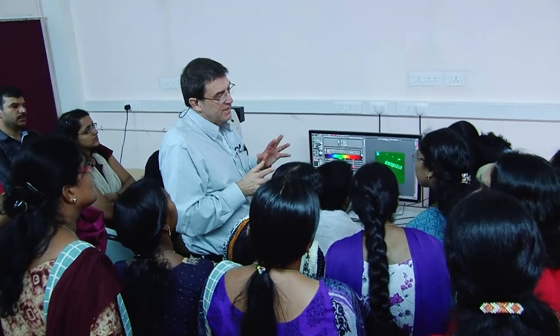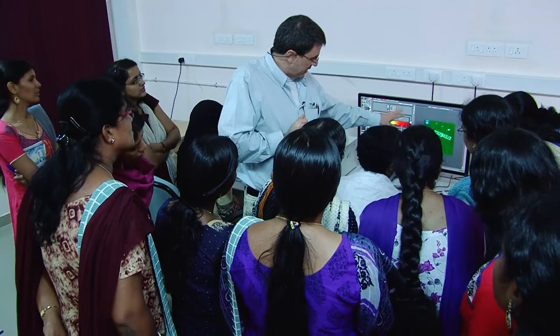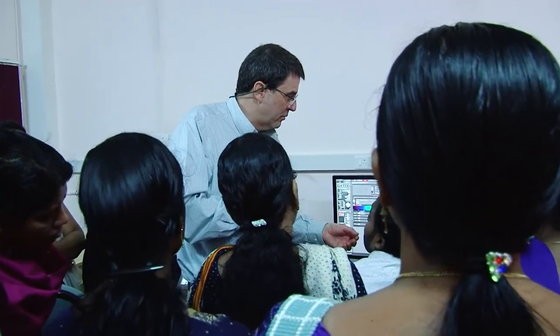Now, you might have some of the image analysis software in this particular software, but I don't know. But a lot of times what I get is people go take pictures on the confocal, then they'll come over and see me, and then we'll open it up in Metamorph and work on it. Metamorph can handle images coming in from a variety of different instruments. That's why I like it, because it can handle different softwares coming into it, okay? And I just like it because I'm familiar with it. So does that all make sense, how that worked?